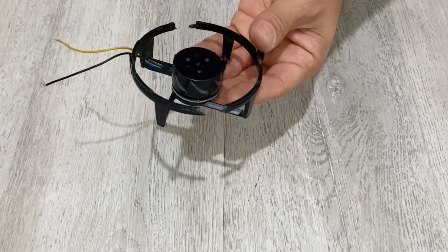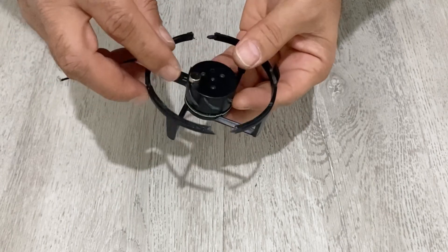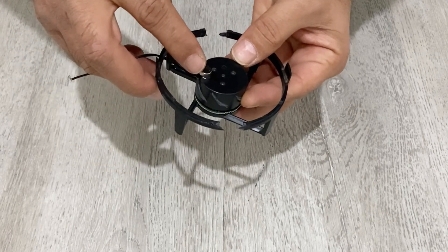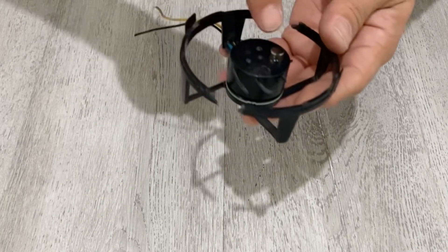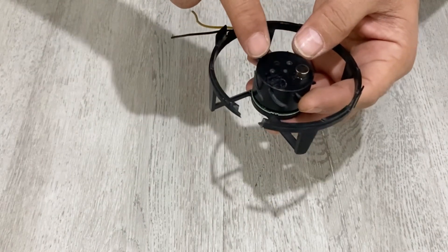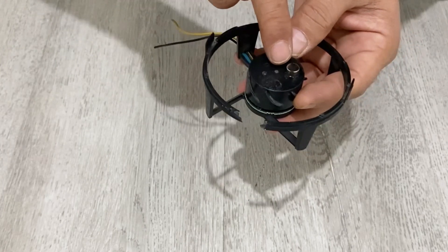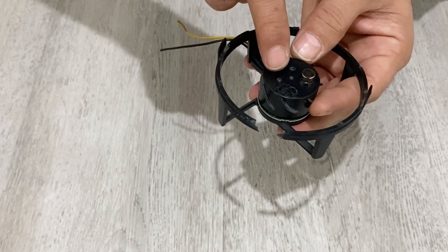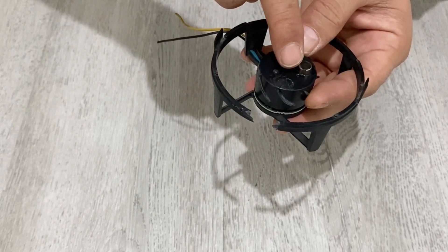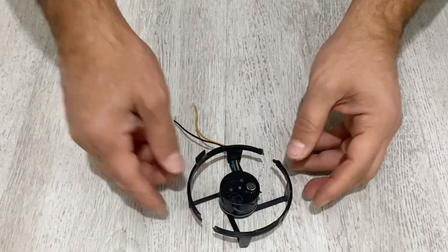I will put my magnets on. I've stuck the first one. Now I am going to stick the other one, but you have to be careful — the distance between the magnets should be equal, and the magnets should be positioned just in front of each other.